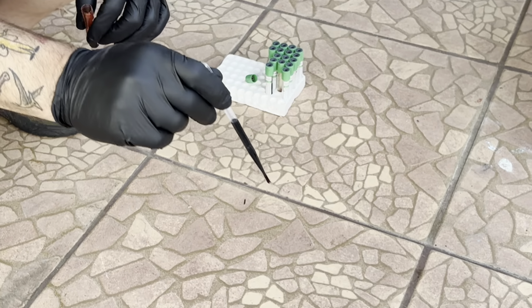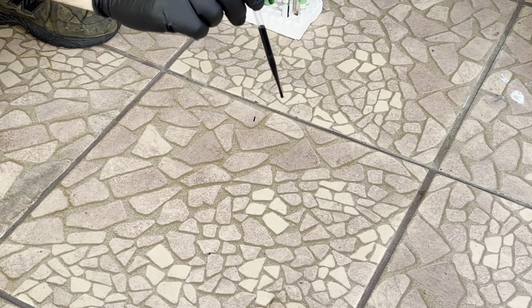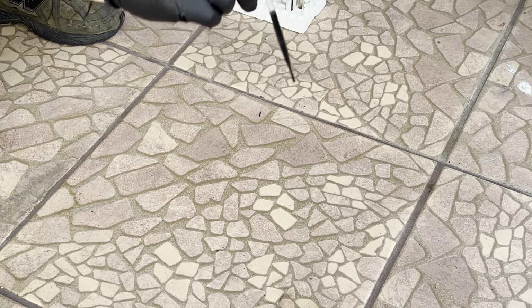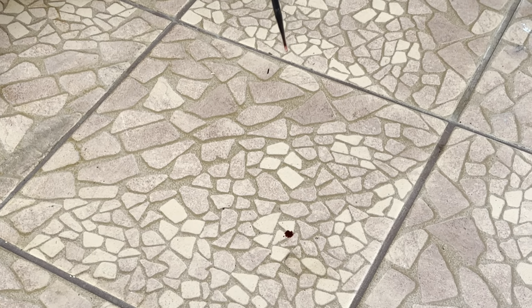Using a pipette, I'm going to make drip stains. Drip stains are just blood that falls off of an object, a bloody object, and it's going to fall to the ground under the influence of gravity only. So when it hits the ground like it did just now, it's going to make an approximately circular drop.